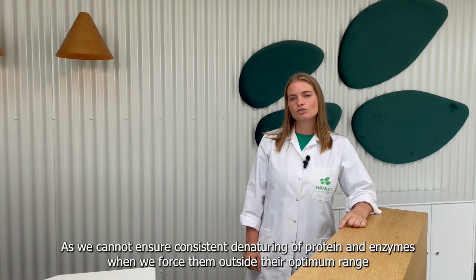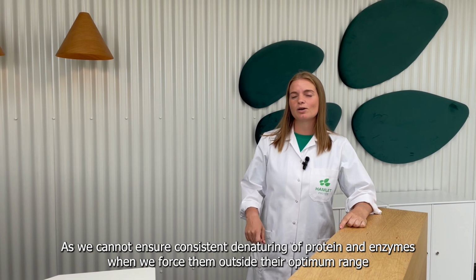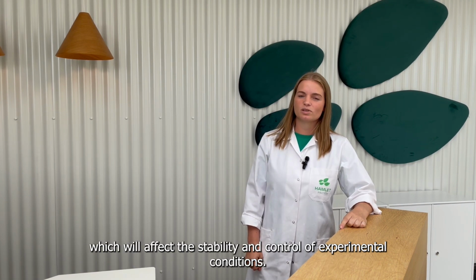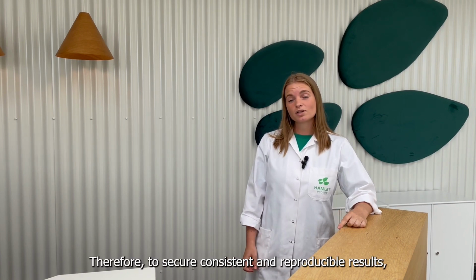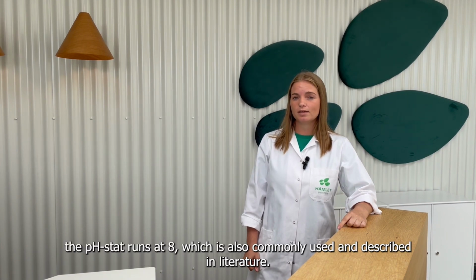As we cannot ensure consistent denaturing of proteins and enzymes when we take them outside their optimum range, this will affect the stability and general control of experimental conditions. Therefore, to ensure consistent and reproducible results, we run the pH-stat at 8, which is also commonly described and used in literature.